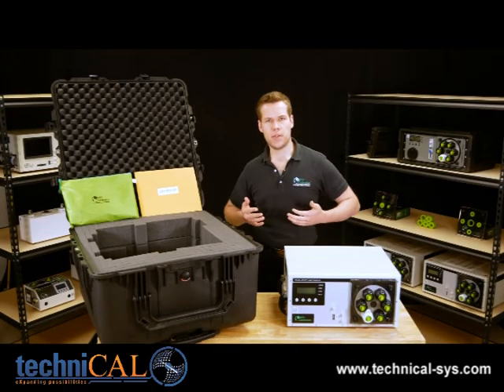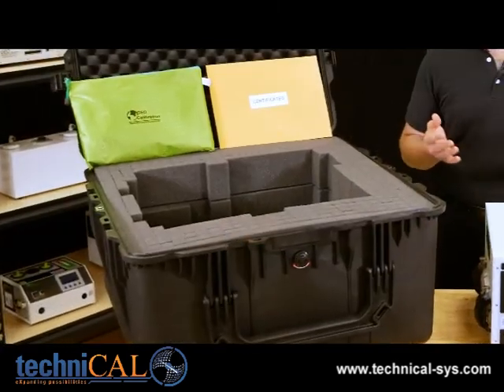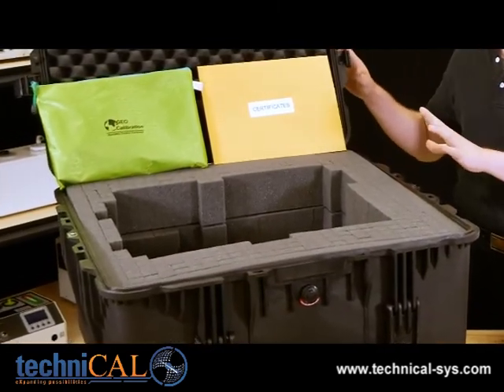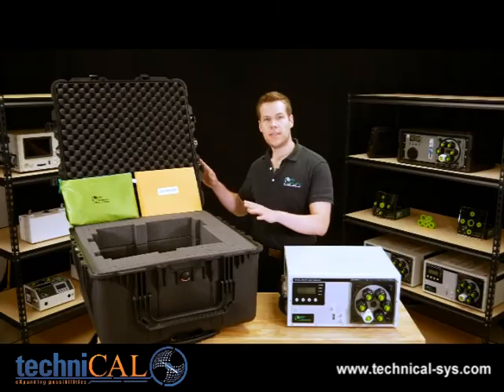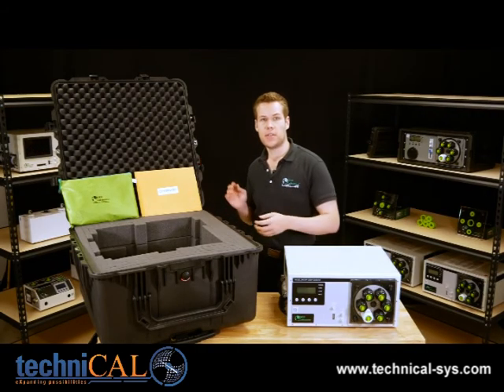The first thing you want to do when you receive your unit is examine it for any shipping damage. As of 2018, we ship all Model 2000 SPs in this ruggedized hard plastic case. You can see that the interior is made of a nice foam, which is specifically cut to prevent damage to the unit during shipping.